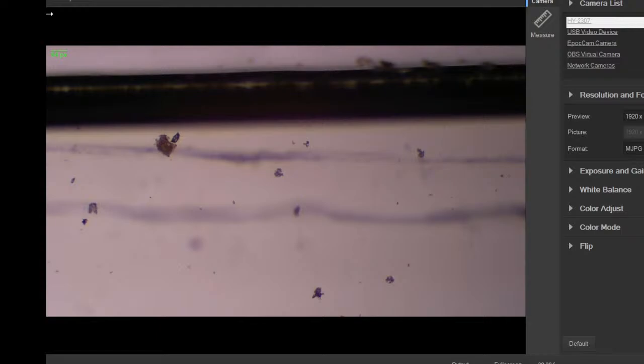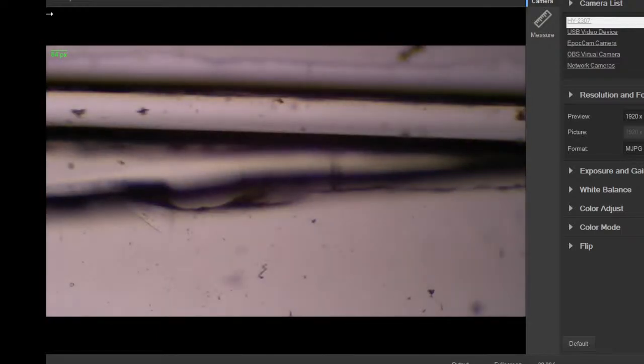Where'd the rotifer go? Yeah, so everywhere outside this curved boundary has dried up.